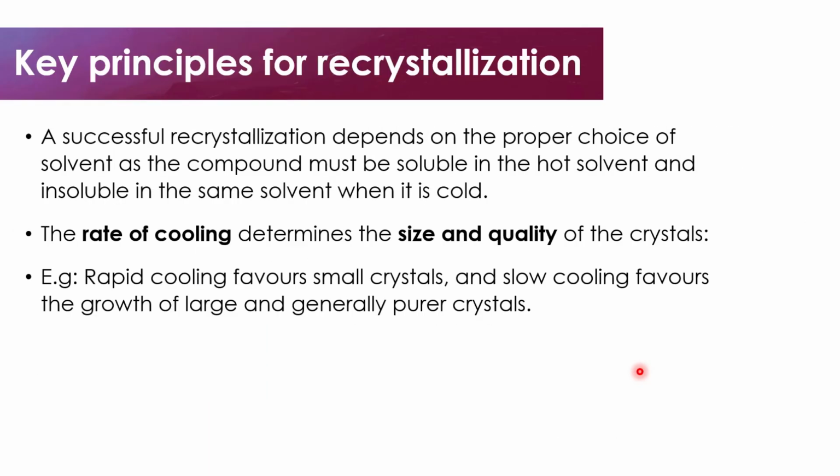Also, a successful recrystallization depends on the proper choice of solvent, as the compounds must be soluble in the hot solvent and insoluble in the same solvent when it is cooled. This is one key thing that we have to note in recrystallization, and that happens to be the choice of solvent, or the suitable solvent that is needed. Also, the rate of cooling determines the size and quality of the crystals. For example, rapid cooling favors small crystals and slow cooling favors the growth of large and generally purer crystals.